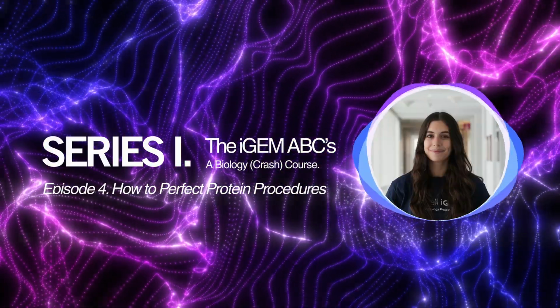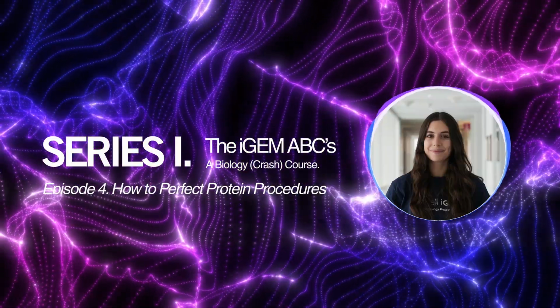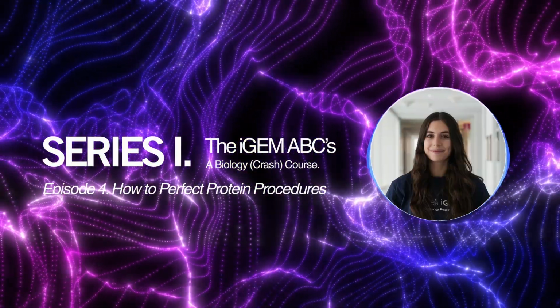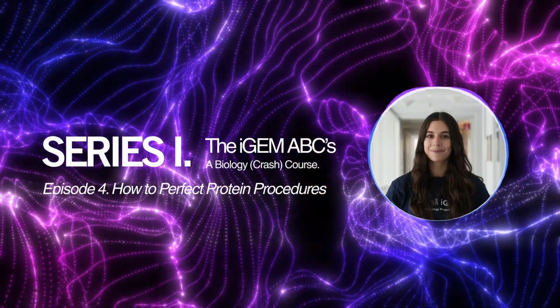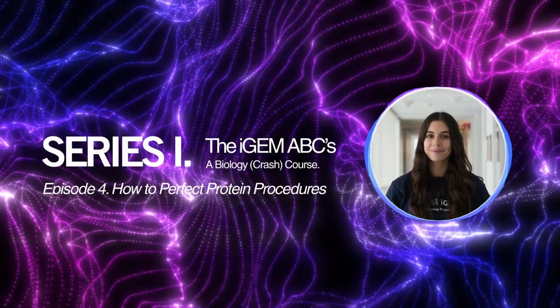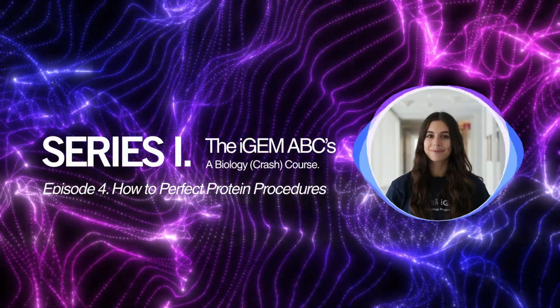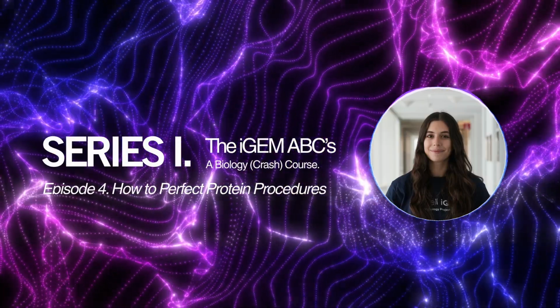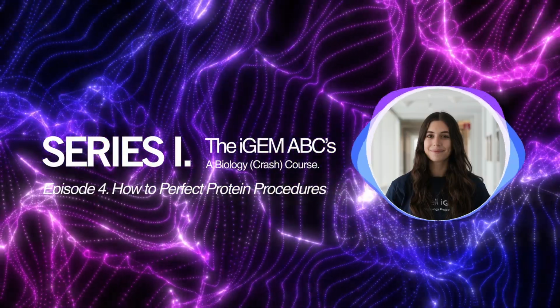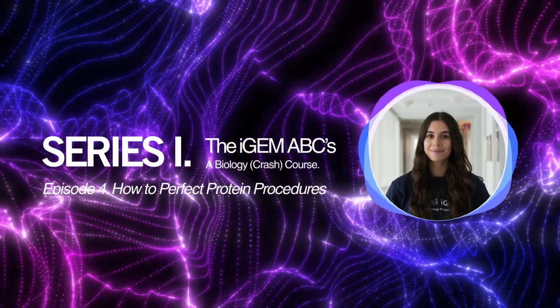Now, we can actually encode some kind of protease recognition site into our amino acid sequence, where those proteases that cut apart protein will cut the polyhistidine or the affinity tag off the protein, leaving only the native structure. And this can allow for a lot of structural characterizations like cryo-EM, which require the protein to have only its native amino acid sequence with no appendages or tags hanging off of it.